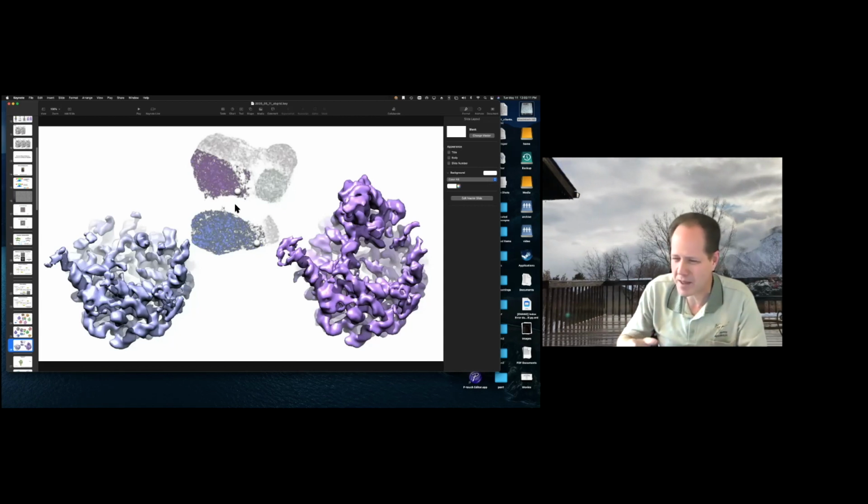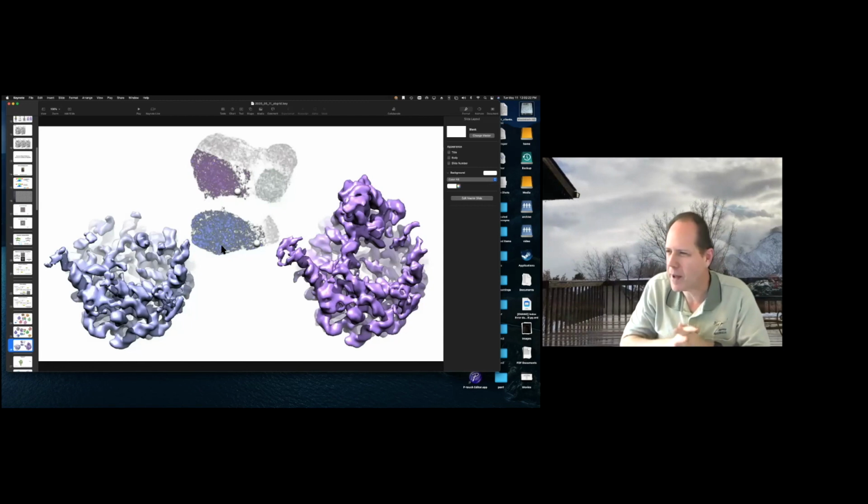But in principle, yes. The idea that this could be treated as an energy space, and you can look at where the populations of the particles are to trace actual real paths through the particle dynamics, still works here, just like it does in all the other manifold methods. But that's more for continuous variabilities.